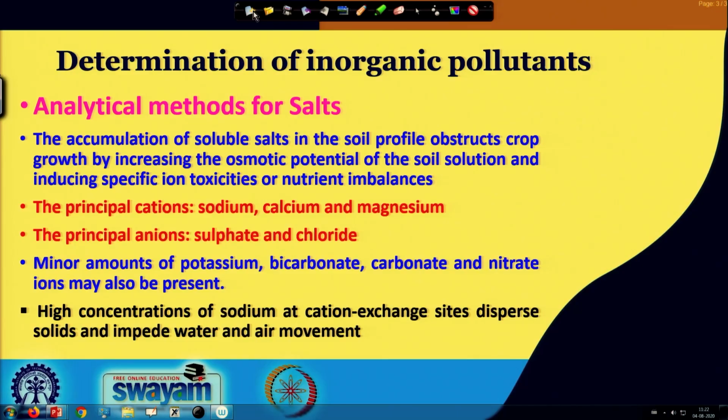So in today's lecture we will be talking about basically salts, then we will be talking about trace elements and other elements, total elemental analysis, and then we will be moving towards the organic pollutants. So let us start today with the analytical methods for salts in the soil.